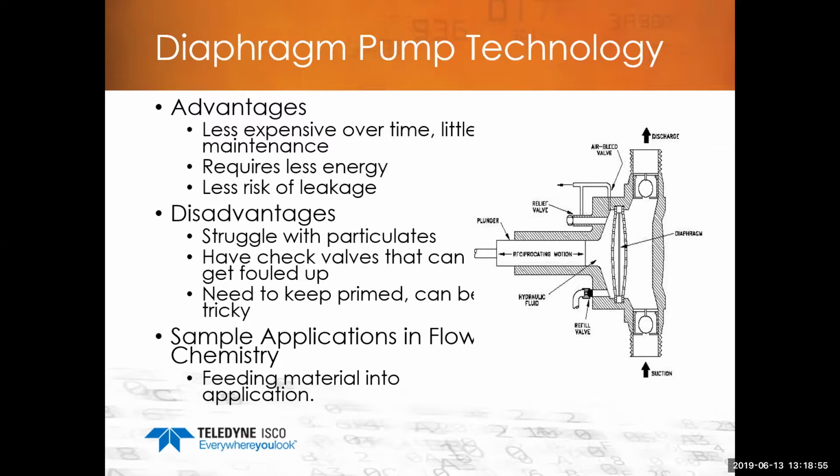You'll see these more on the production level scale because you get higher flow rates. But as with reciprocating pumps, this style typically has check valves too. So viscous materials are just not going to work here. So in our discussions, let's just talk about one thing real quickly. We talk about viscous materials. I talked about 4 technologies. There's only 2 that you really would want to use, either peristaltic or syringe. So that's the kind of thinking you need to have as you're coming into it.